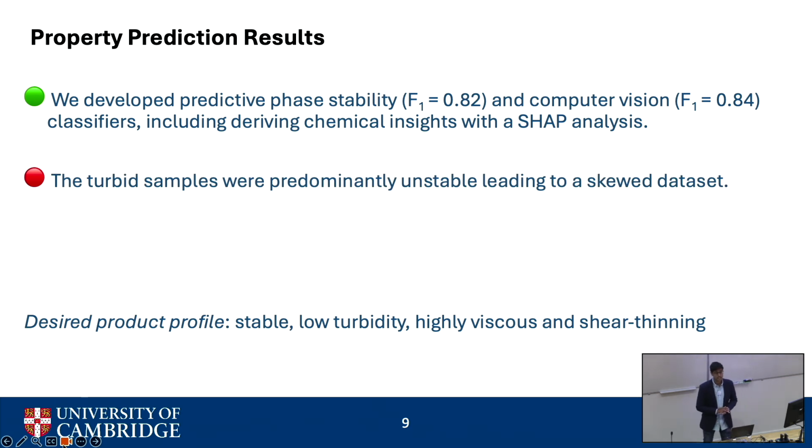One of the other objectives was the turbidity. However, here, unfortunately, as most of the turbid formulations were unstable, the actual turbidity dataset that I've collected had a rather skewed distribution, and so when I tried to develop a regressor, this was ultimately quite unsuccessful, unfortunately.